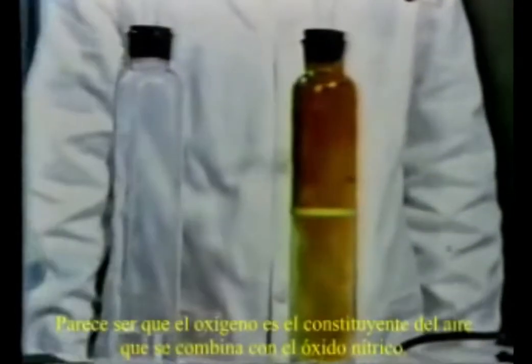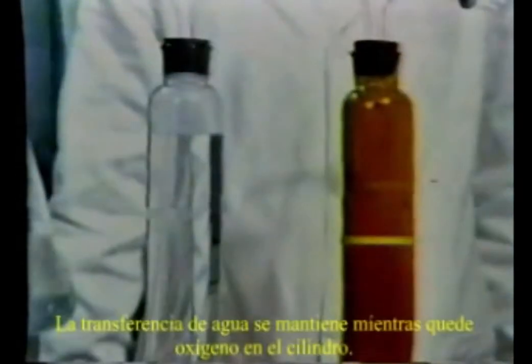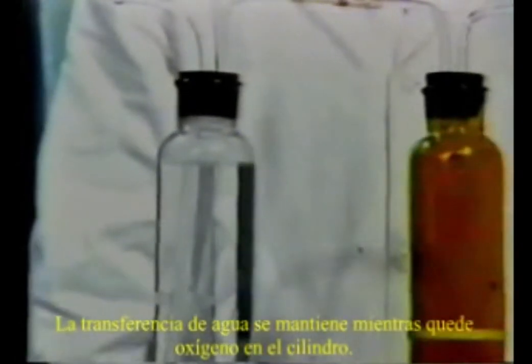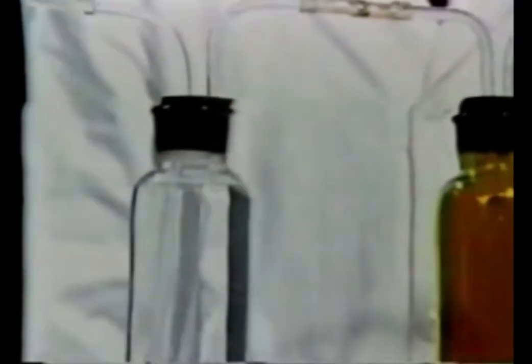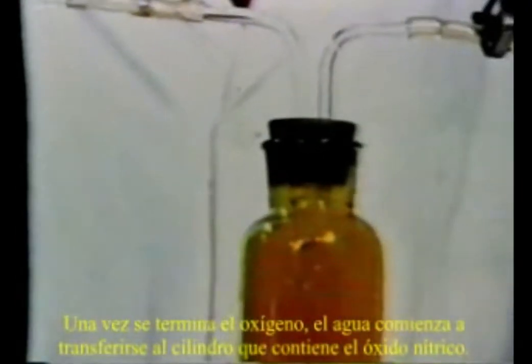We see that oxygen is the constituent of air that combines with nitric oxide. The water continues to enter the oxygen cylinder as long as oxygen remains. Then, when the oxygen is expended, water begins to transfer into the nitric oxide chamber.